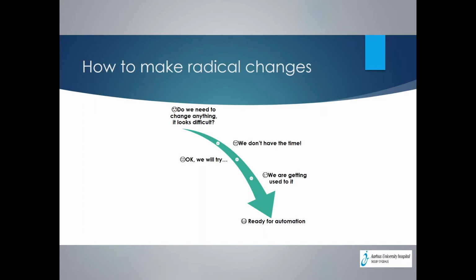a lot of samples at a time, and we would have very few samples to do PCR SSP on. And since we need to keep people really trained for doing this in acute situations, we need to do both. And I could really recommend this way of typing.